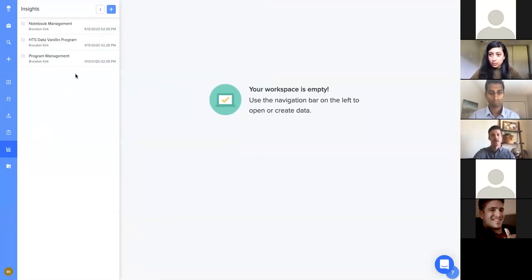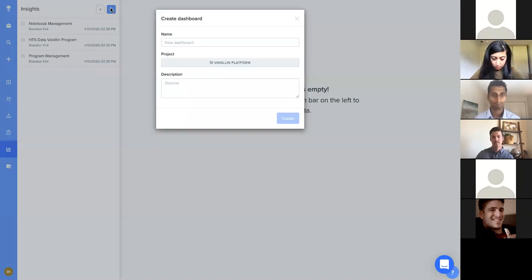Okay. So when you are configuring a dashboard, it's very similar to the way that you would create things like projects or other registry schemas in Benchling. You're going to use this blue plus icon to configure a new dashboard. When I click the plus icon, I'm popped up with a modal, and I have three things to decide on. The first is the name of my dashboard, which today we'll be focusing on a use case where we're testing the toxicity of different toxins on the growth curve of the strains that are at my company.